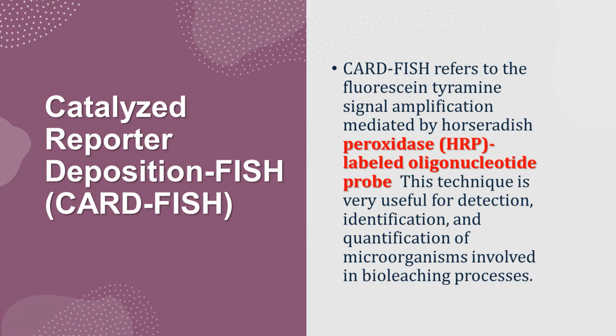Catalyzed reporter deposition FISH, CARD-FISH. CARD-FISH refers to the fluorescein tyramine signal amplification, mediated by horseradish peroxidase, HRP, labeled oligonucleotide probe. This technique is very useful for detection, identification, and quantification of microorganisms involved in bioleaching processes.